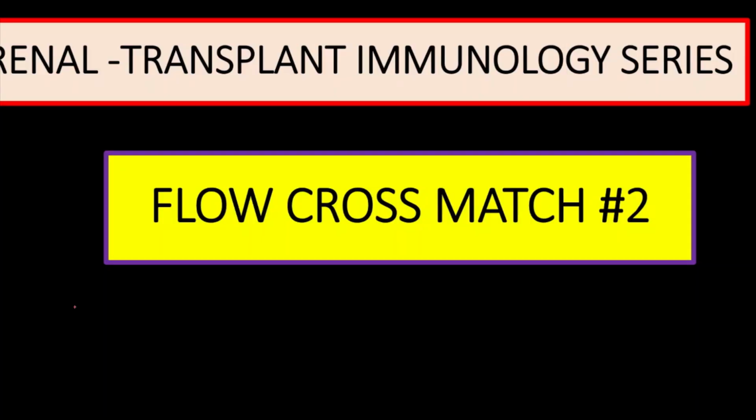Good evening all. Today the video is regarding flow cross match, the part 2 video of the renal transplant immunology series.